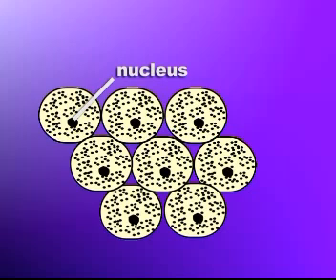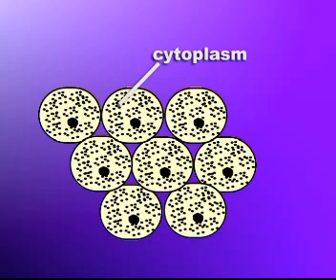Can you now distinguish the nucleus and the cytoplasm? Yes, you can see the nucleus here and the cytoplasm.